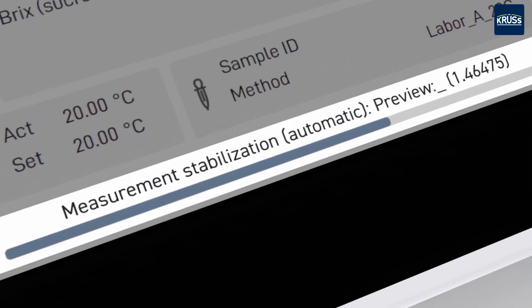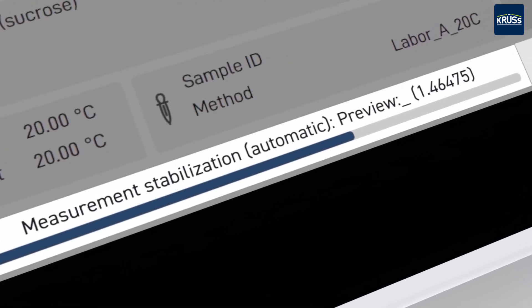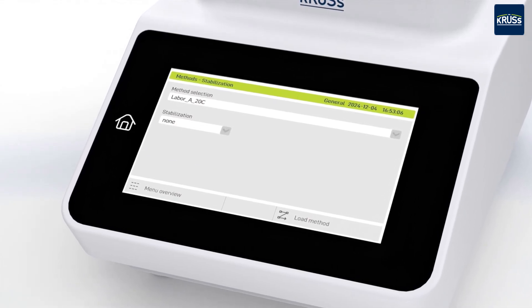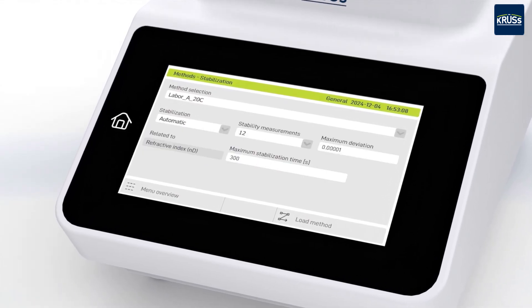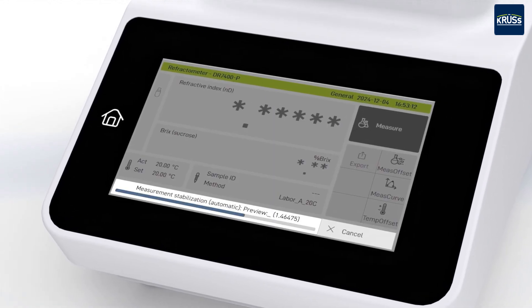Once the measurement has started, a preview of the measured value updated every second will be available. The CRUS measurement stability check ensures that only measurements that meet your stability criteria will be saved in the results table.